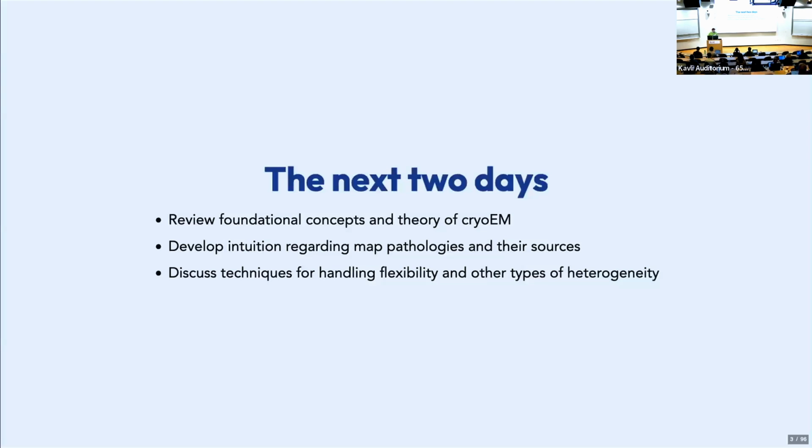My other goals are to help develop some intuition regarding map pathologies. This is a skill that you develop just by doing cryo-EM: the ability to look at a 3D map and see, at first you just look and you're like, this is bad. And then you learn, okay, it's bad in this way. And then you learn when it's bad in that way, it usually means this. I'm going to try and help jumpstart that process so you can develop that intuition a little faster.